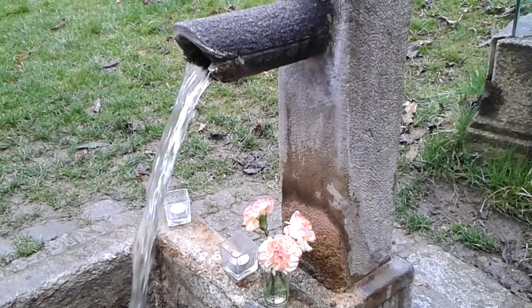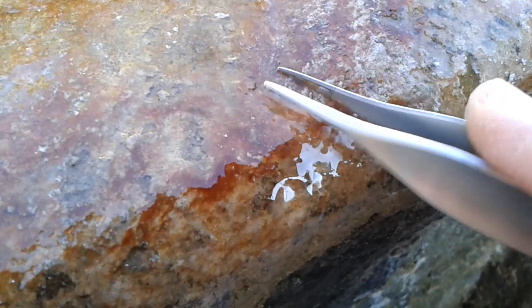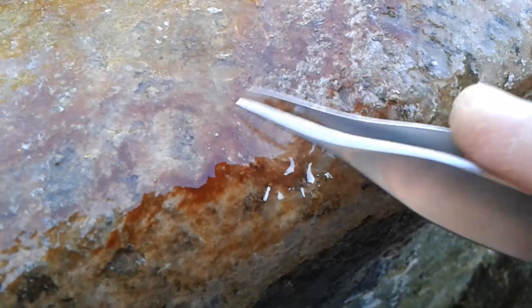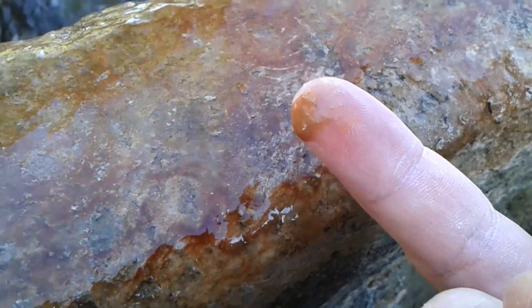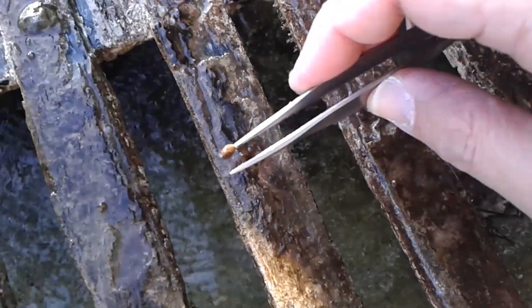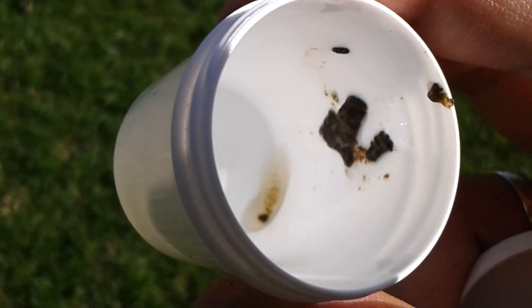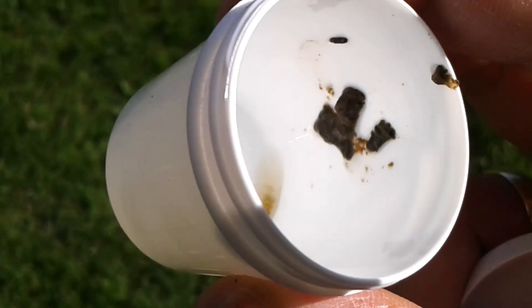A biofilm consists of microorganisms that stick to a surface, and you can often find them in very moist and wet areas like this fountain. I'm scratching off some of the slimy material from the fountain surface and you can see it is slightly reddish-orange. There is certainly some interesting material here. I took two samples and I'll now go back into my lab to have a look.